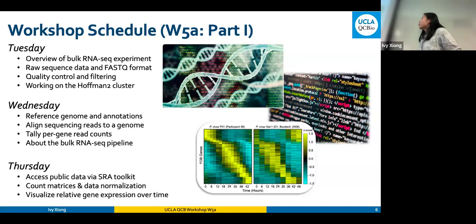Right. So we were talking about the bulk RNA-seq pipeline. So why do we need a pipeline? The issue is if we have a laptop, let's say I want to align 10 samples, not a lot. We have 5 replicates for control, 5 replicates for treatment, whatever. These 10 samples, usually you're dealing with, let's say, 100 GB of data. You want to process them, align them, and then get to your count table.